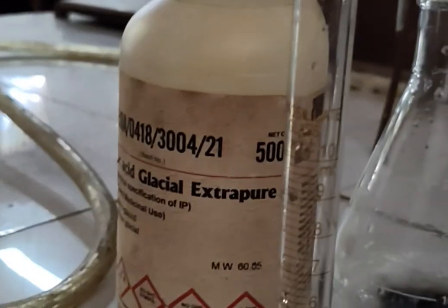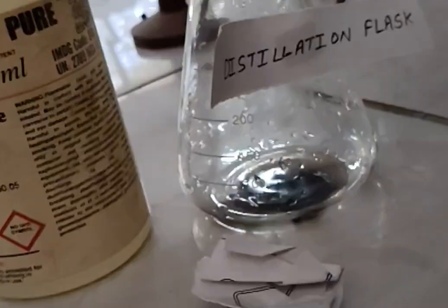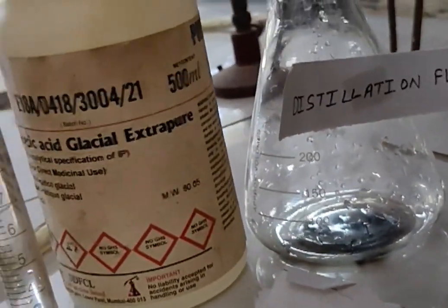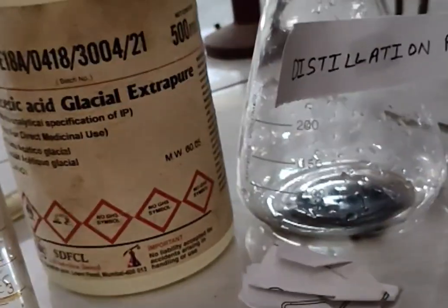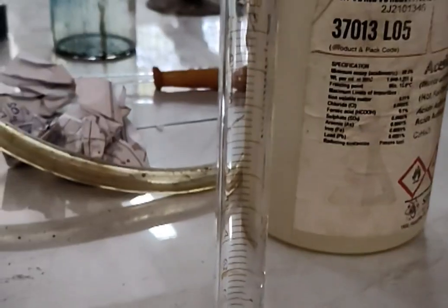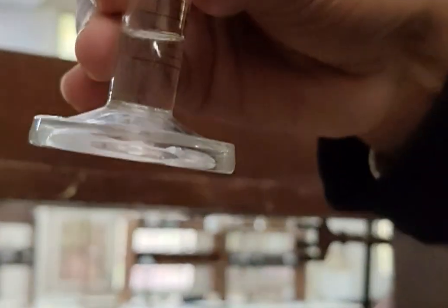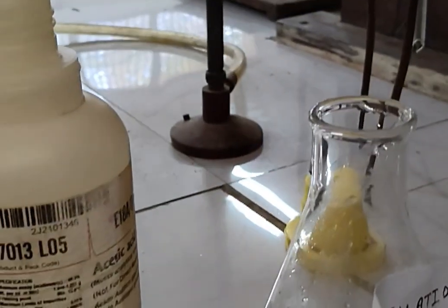The materials needed for our experiment are measuring cylinder, glacial acetic acid, sodium acetate trihydrate crystals, and distilled water, conical flask. First, we will take 1.5 ml of glacial acetic acid in the measuring cylinder and we will make a 100 ml solution of acetic acid in a beaker.